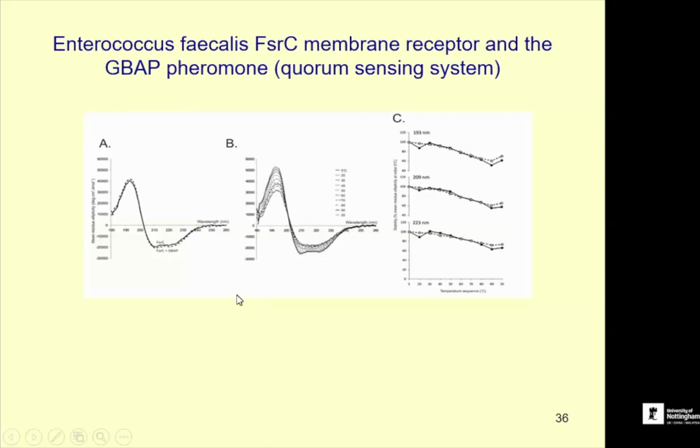Sorry to overrun. On the graph, say you have a protein that has alpha helices and beta sheets. Would you see a difference? Would you see two curves, or would it be something that is merged together?